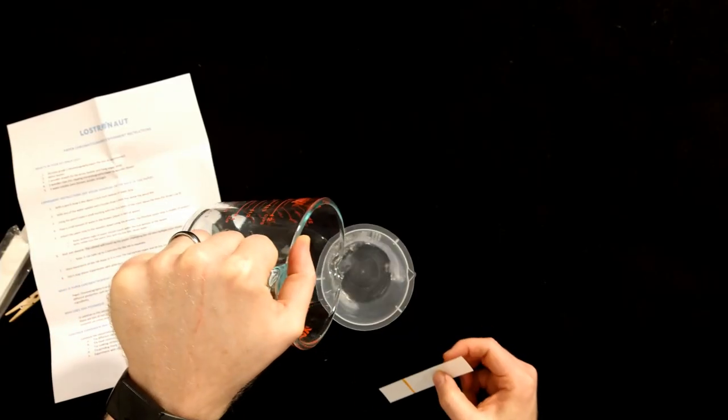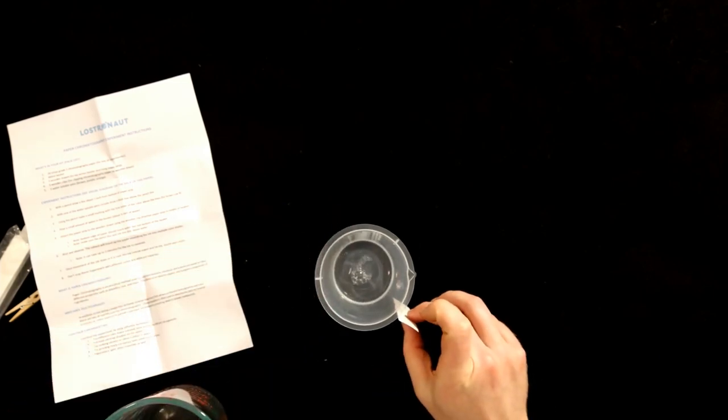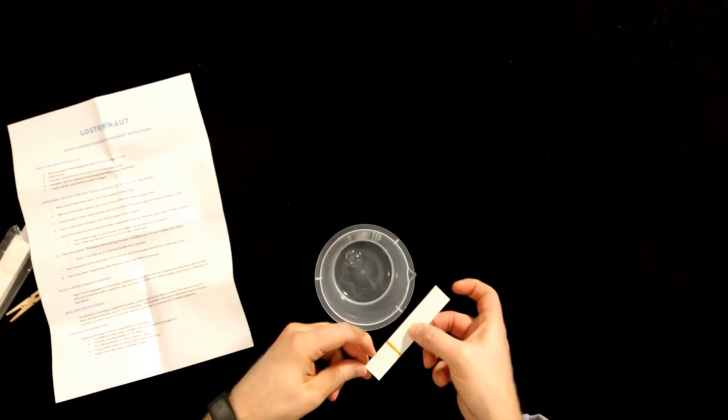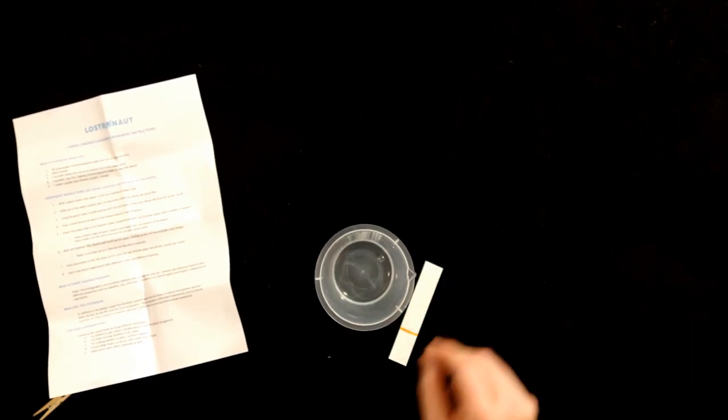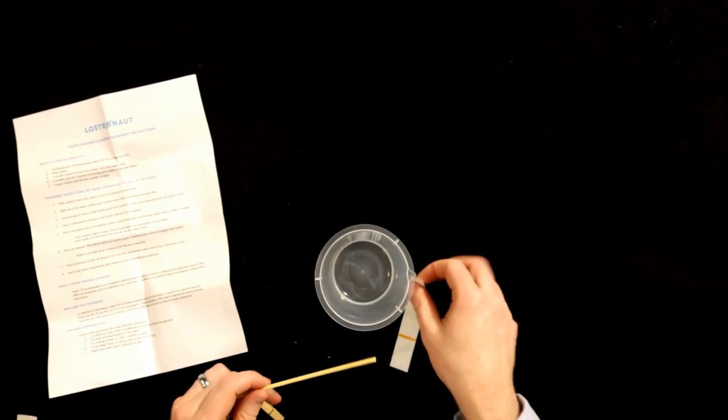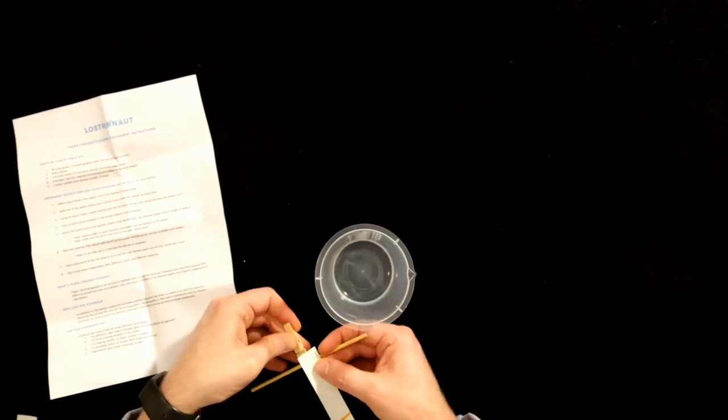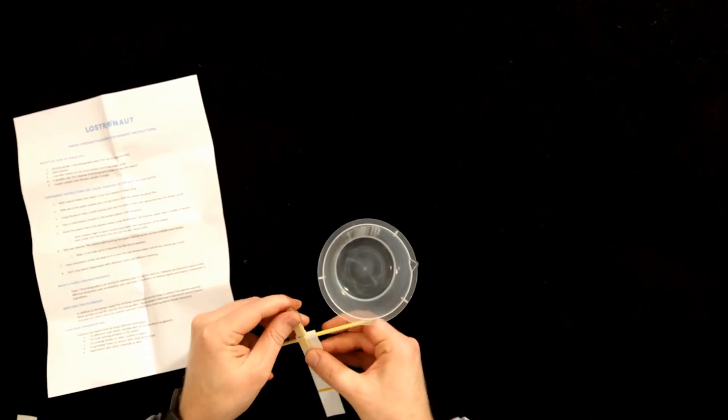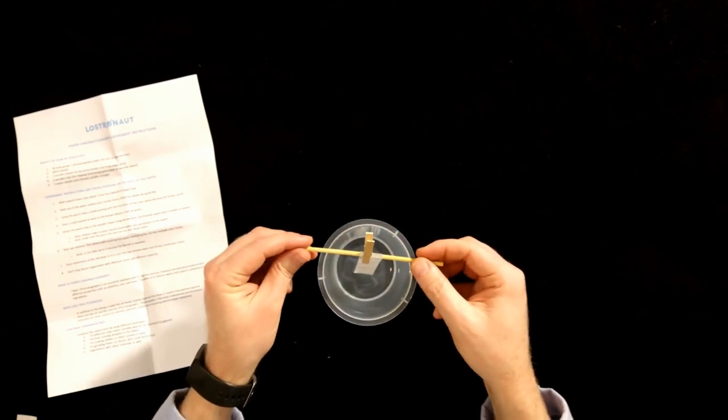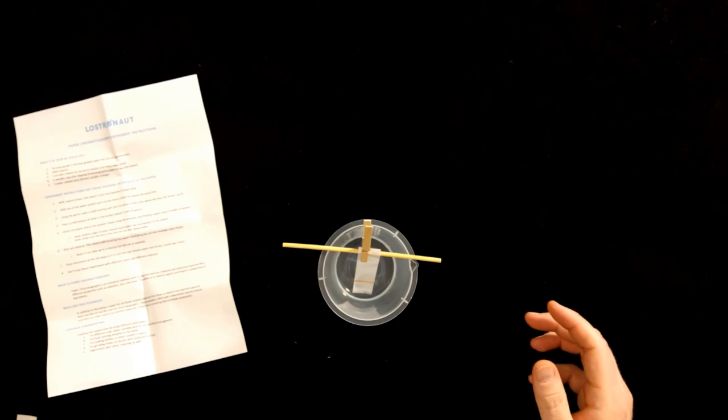And then, pour a small amount of water into the beaker. I want to make sure that's not as tall as the line. So I've poured water up to about this level. Then, take one of our wooden dowels. Attach our paper strip to the wooden dowel. I'll position the paper in the middle of the beaker. So we're going to let that hang. And then we wait.